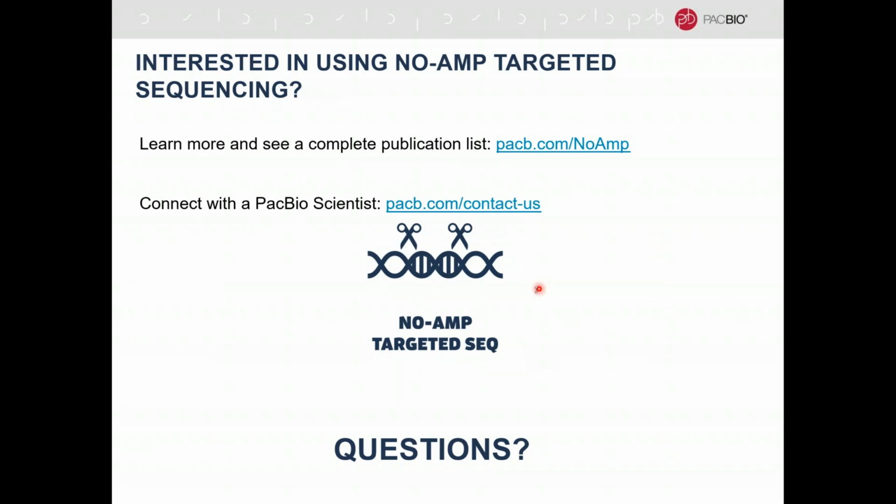With an expansion, of course, for some of these, that's the insert size, but then with the expansion, they can be much longer for some of the larger expansions. We have tried, tested some up to 16 kb. That doesn't mean that that's the end all. We just haven't really tested it too much to see where it breaks down. But at least up to 16 kb, we have seen, we tested so far. So what you really need to think about is then the CCS reads.